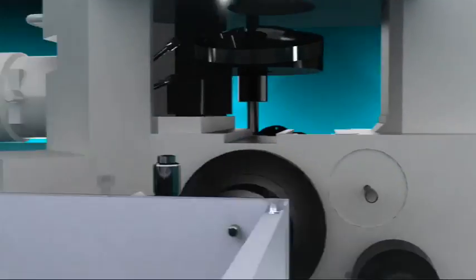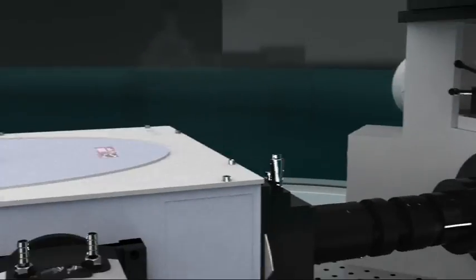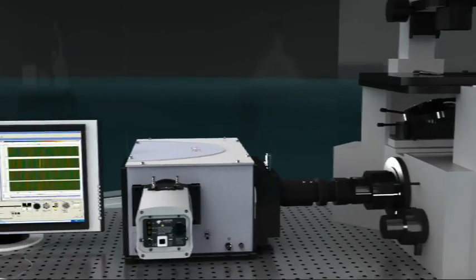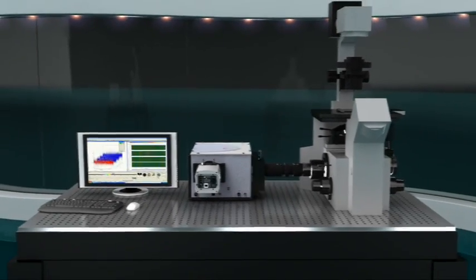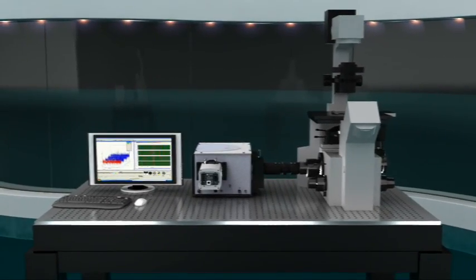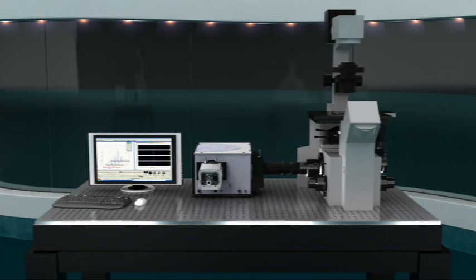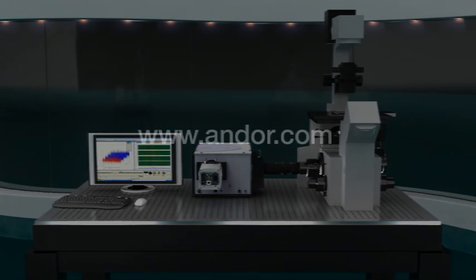Andor Solace software enables seamless and sequential handling of imaging and spectral information, allowing export to users' own data post-processing interface for maximum flexibility. Inspired solutions from the leaders in modular spectroscopy, Andor Technology. Find out more at www.andor.com.